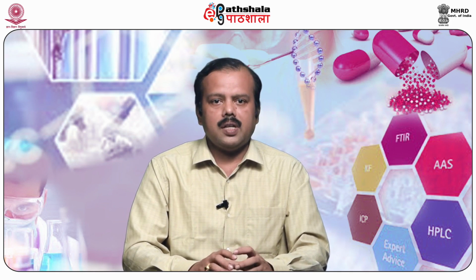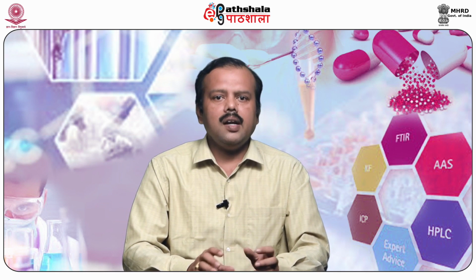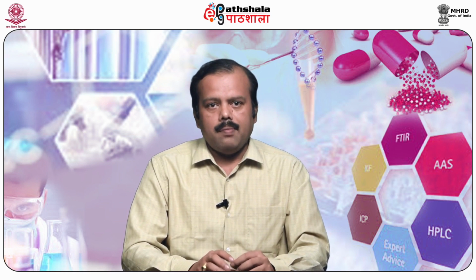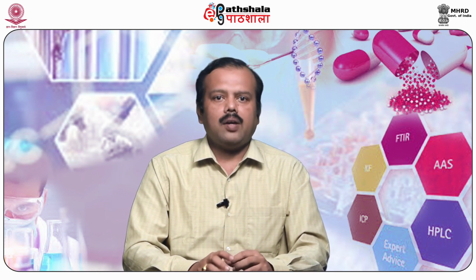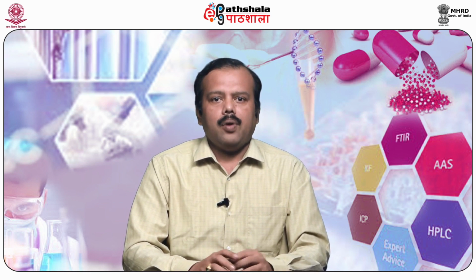that is 70% ethanol. Before using the laminar flow, the surface of the laminar flow unit is cleaned with 70% ethanol. The materials, that is culture medium and glassware, are kept inside the unit, except the live microbial cultures. Then the UV lamp or germicidal lamp is kept on for 15 minutes.